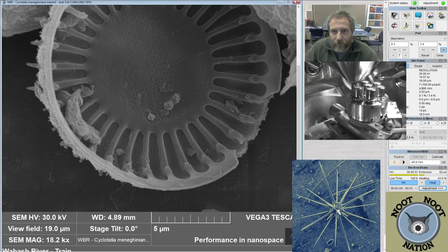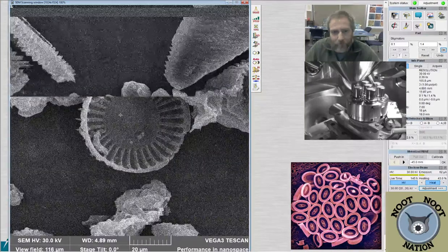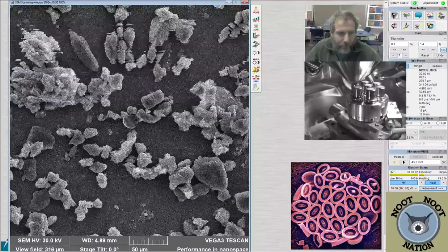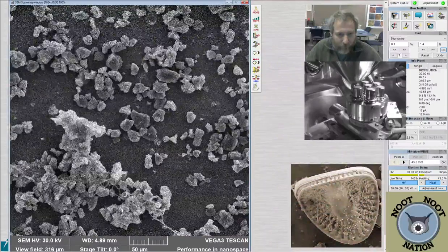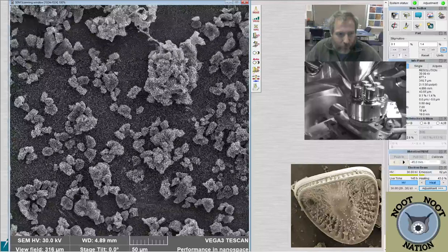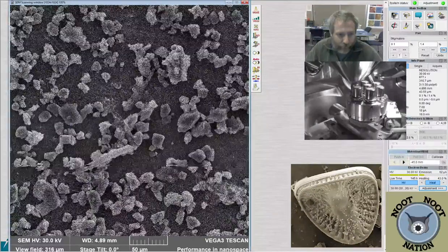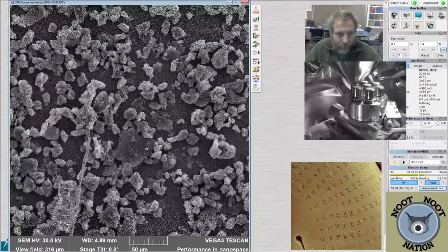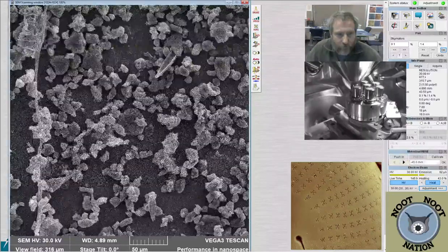I have to keep an eye on the clock today. I actually have something going on at 3:15 or something. So that'll be good. That actually is something that's a common diatom, and that's a real nice view of it. So I'm happy about that. And pretty happy with the Pleurosira that we saw earlier as well. A couple of them. Internal views, or no, we saw an external view. Yeah, so I think two external views.